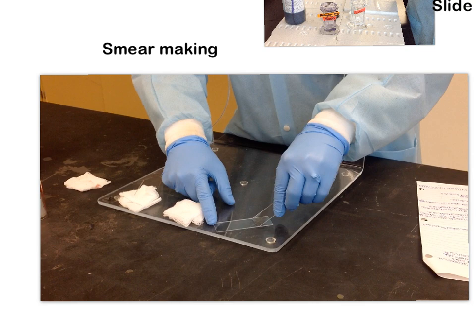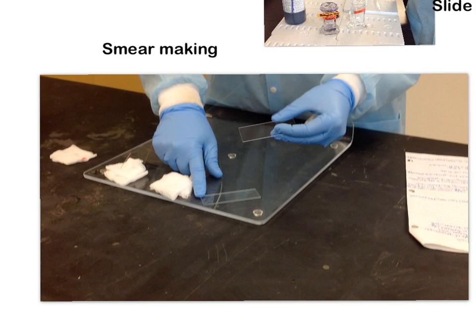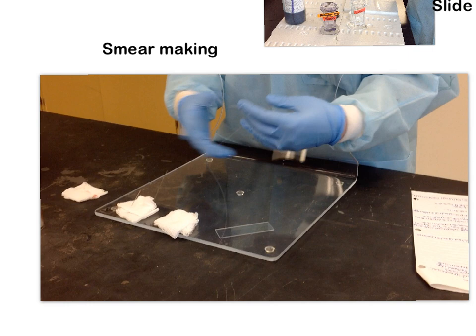If you use too much pressure, you're going to end up with short, jagged smears, and there's also the potential that you could break your spreader slide, sending shards of glass flying — which your neighbors will not appreciate. If you don't use enough pressure, your slides are going to be super long and watery and won't be useful.